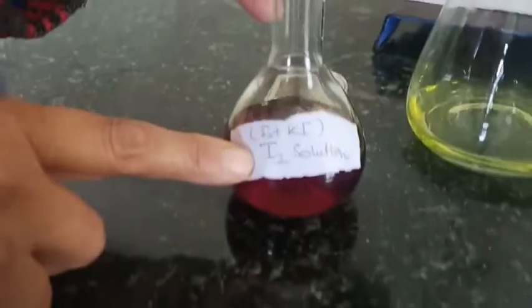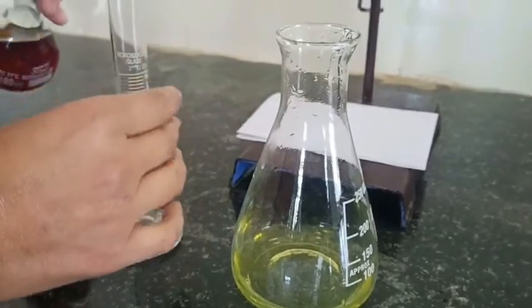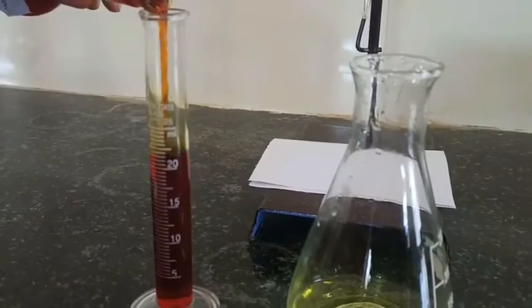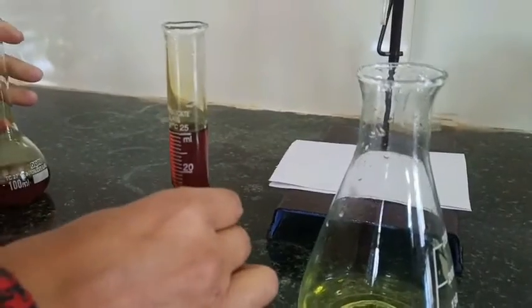To this vitamin C solution I am going to add iodine solution, and here I am going to add 50 ml of iodine solution. So first I am going to add 25 ml.